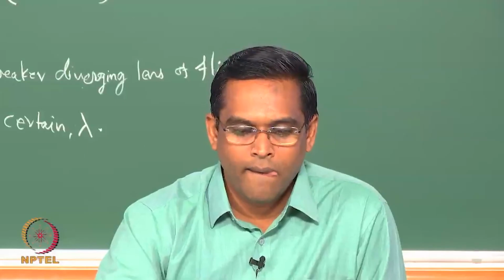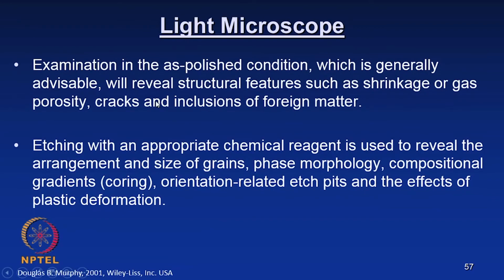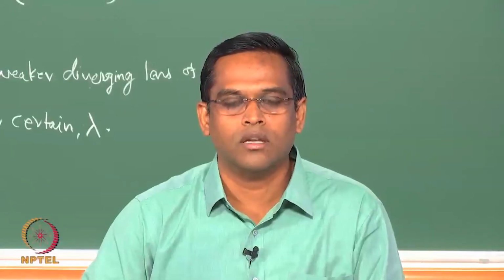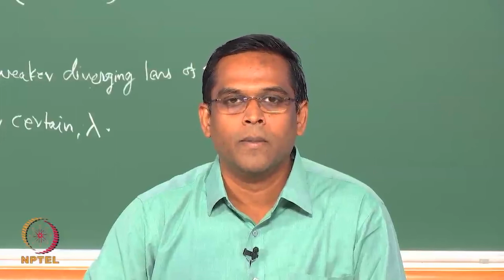We will now see the general description of the light microscope. If you look at all the three classes, I have taken some of the fundamental concepts which you require to understand before we get into the use of this light optical microscope. I hope it will be useful in order to understand the functions of different variants of optical microscopes.